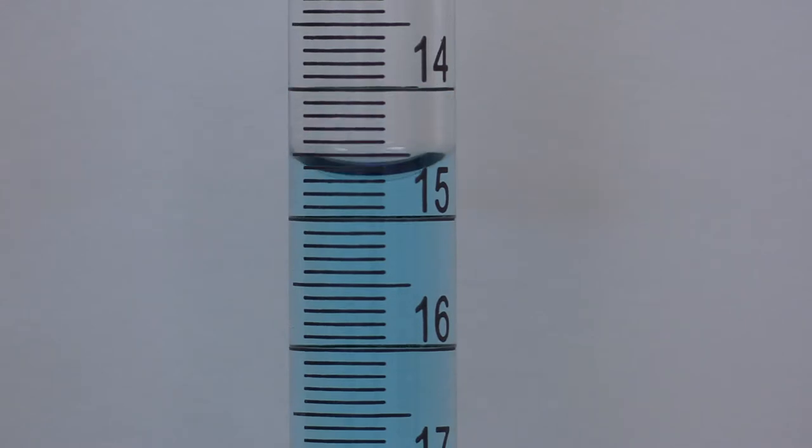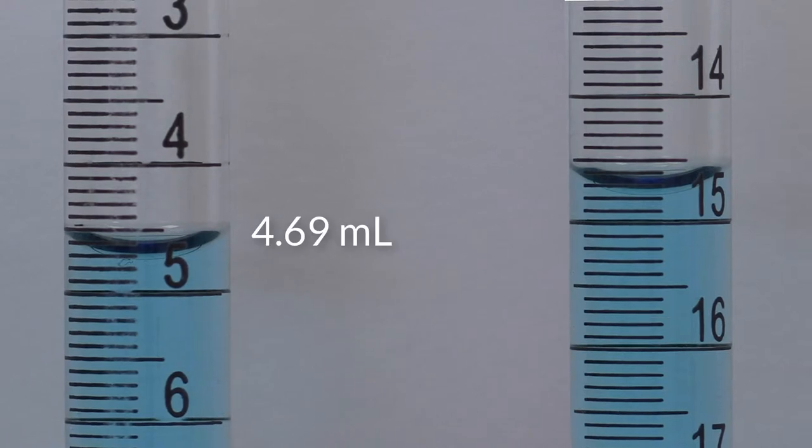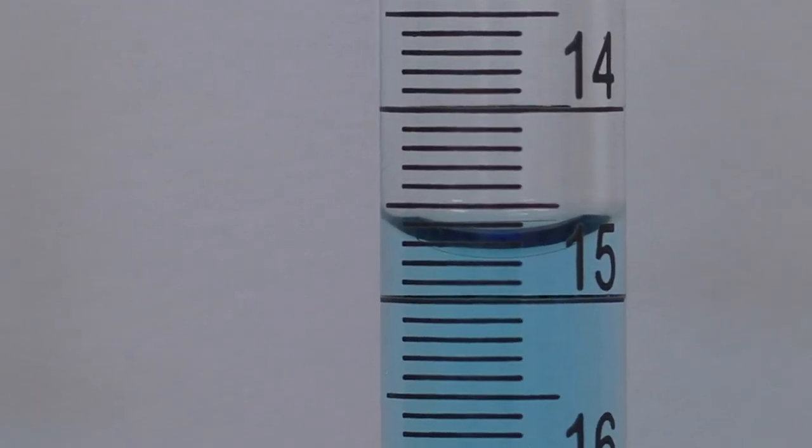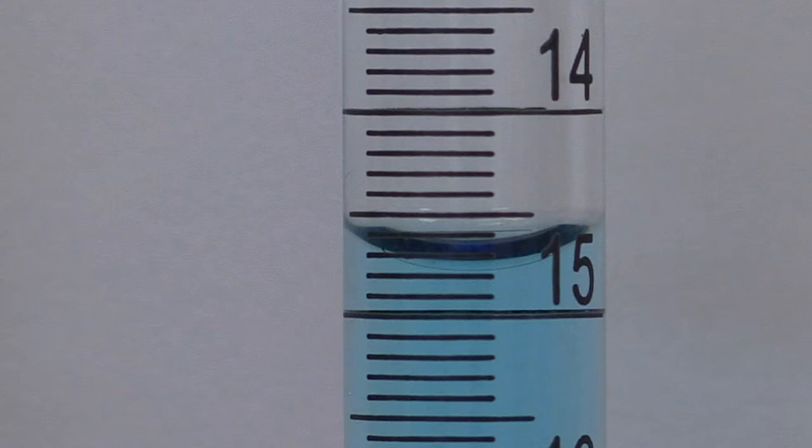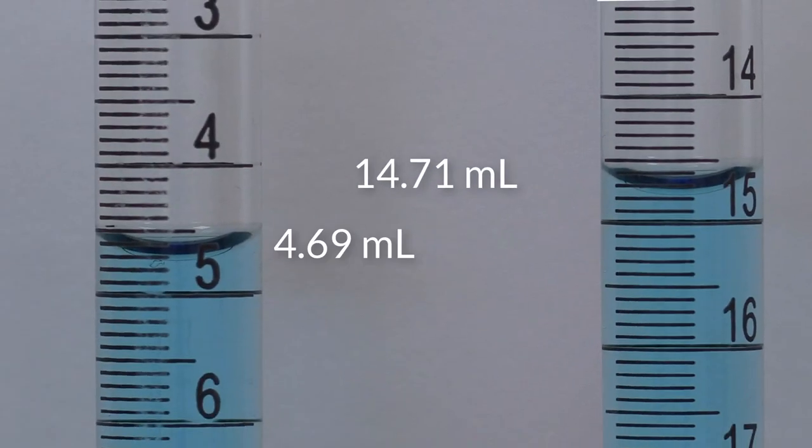We started the titration with a volume reading on the burette of 4.69 milliliters. When the titration is completed, the reading on the burette is 14.71 milliliters. To find the volume of the titrant added, in this case sodium hydroxide, we subtract the two values which gives 10.02 milliliters.